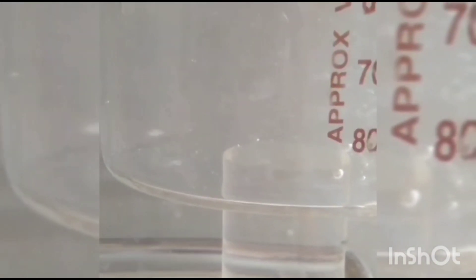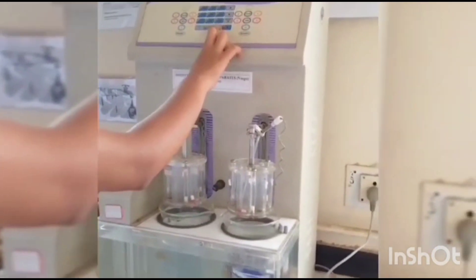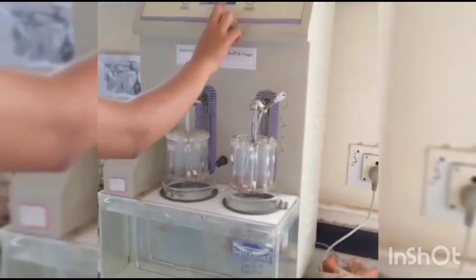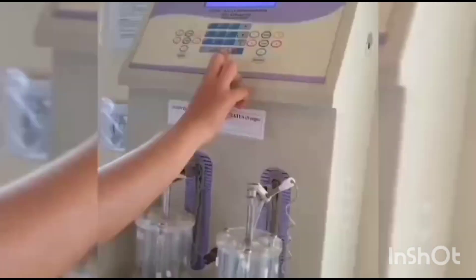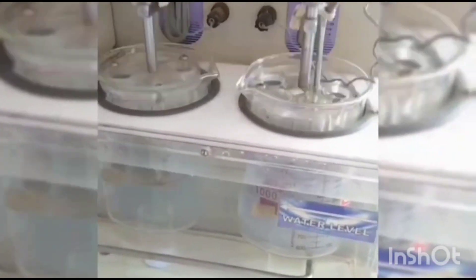Calculating disintegration time for the capsules: 1st capsule — 9.45 minutes at 39.1 degrees Celsius. 2nd capsule — 4.14 minutes at 38 degrees Celsius. 3rd capsule — 6.32 minutes at 38.3 degrees Celsius. 4th capsule — 4.51 minutes at 38 degrees Celsius.